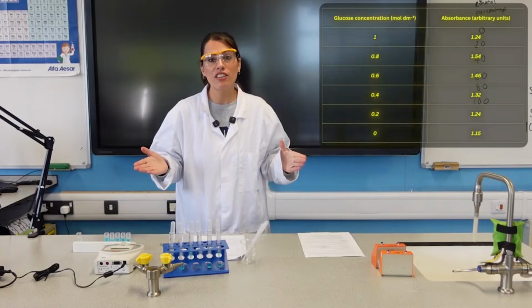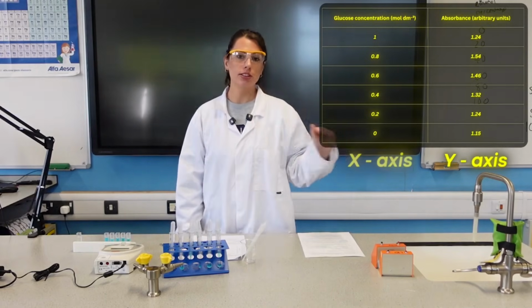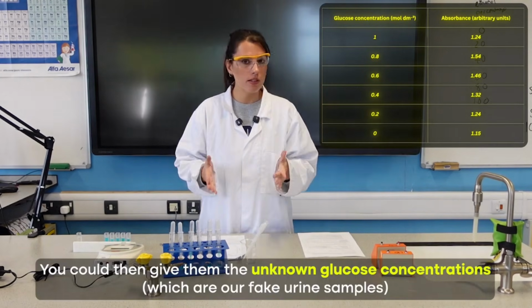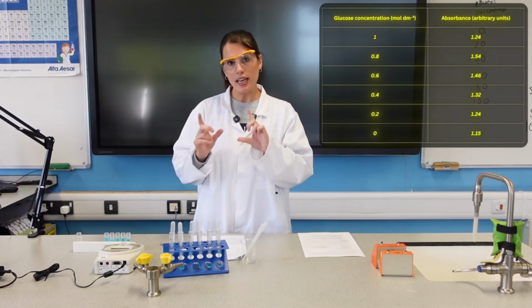So now you've got your results, your students would plot the absorbance on the y-axis and the concentration of sugar on the x-axis, plot their data and create the calibration curve. And you could then give them the unknown glucose concentrations, which are our fake urine samples. They would do exactly the same thing again.